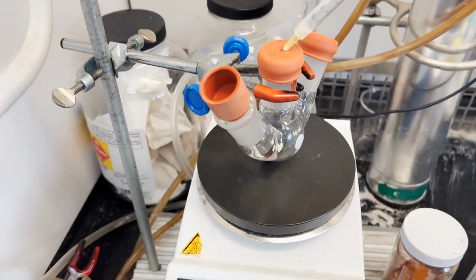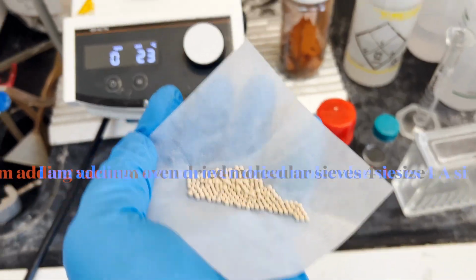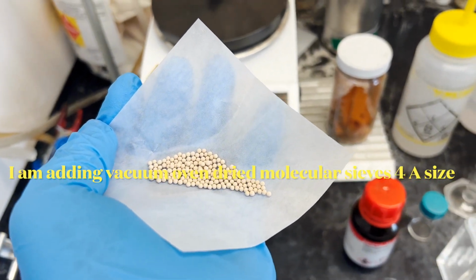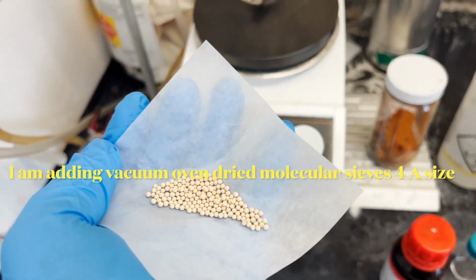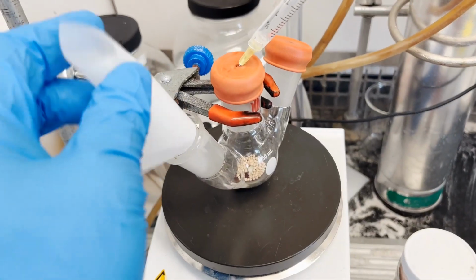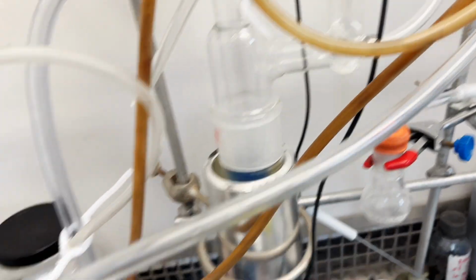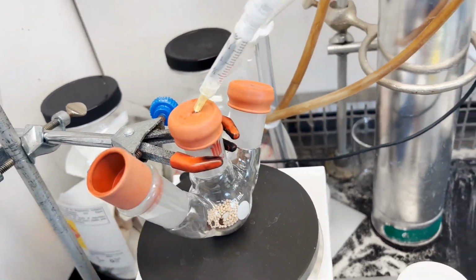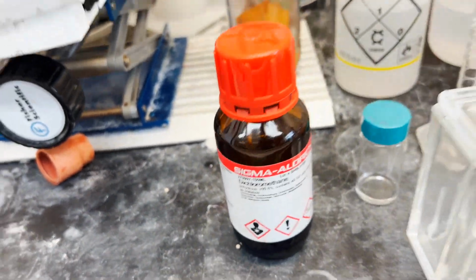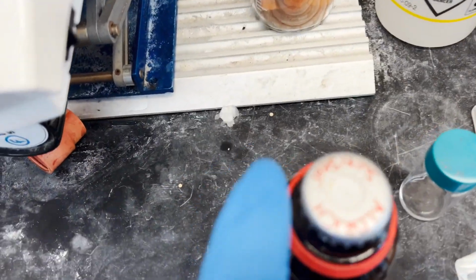Now I closed the flask, and I'm measuring some other things. Here are the molecular sieves. You can use 4 angstrom molecular sieves, which should be really dry, vacuum oven dried. I'm adding the molecular sieves because, as in my previous discussion, molecular sieves should be used to remove the water produced in the reaction, to move the reaction in the forward direction, because it is in equilibrium. It forms water and the Schiff base. So in the presence of water, the Schiff base can break down to amine and aldehyde again.